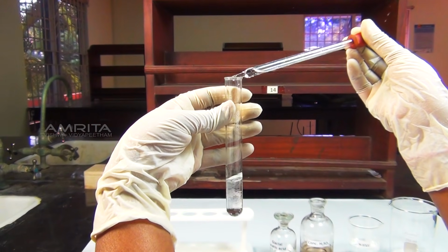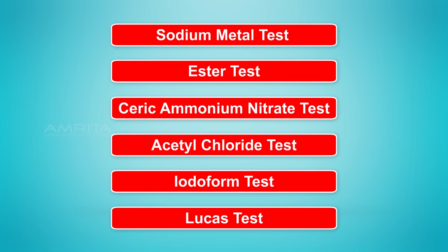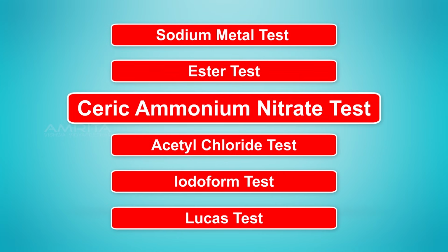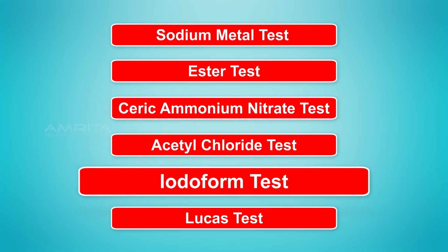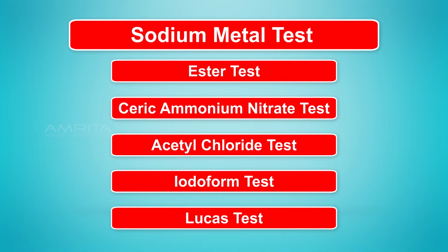Our aim here is to identify alcohols using some simple tests. They are sodium metal test, ester test, ceric ammonium nitrate test, acetyl chloride test, iodoform test, Lucas test. Sodium metal test.